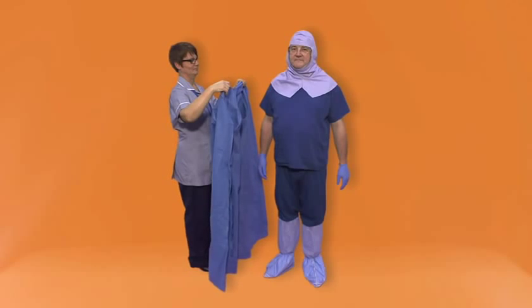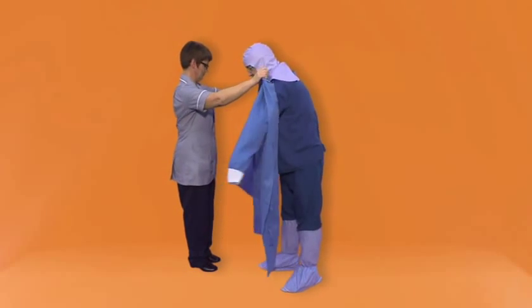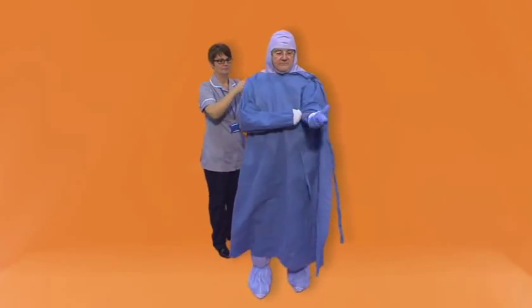Gown. Your buddy is required to help fit your fluid repellent gown. Put both arms in the sleeves and wear the gown over your inner gloves.